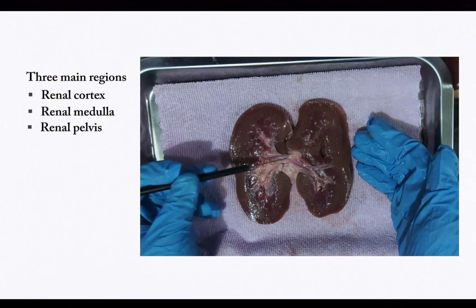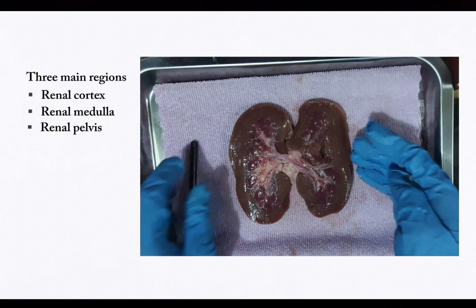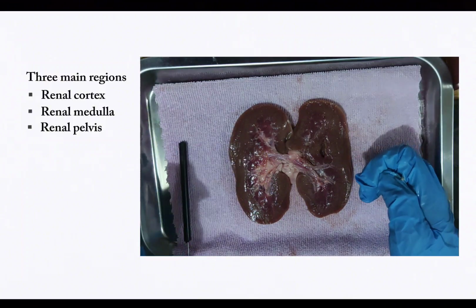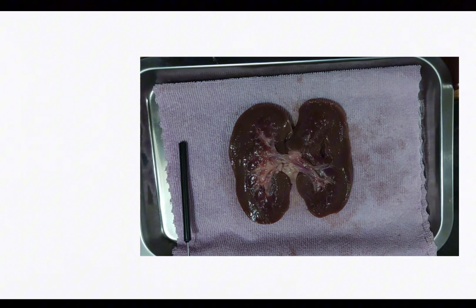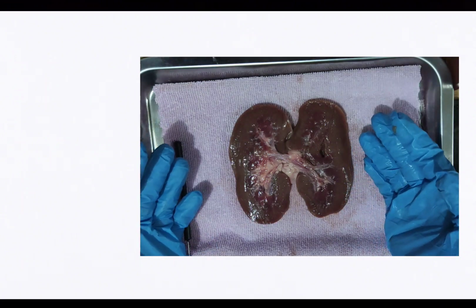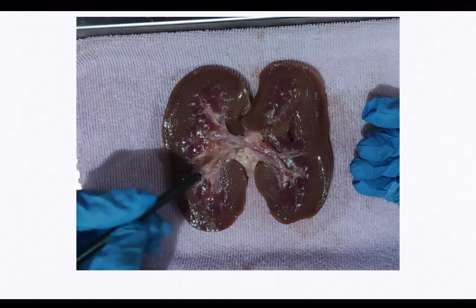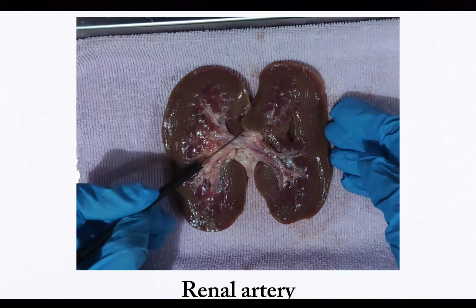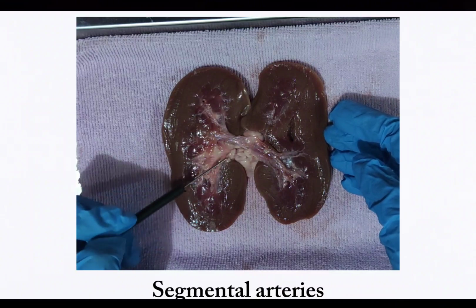Now that we know the three main regions and parts of the kidney, let us dive deeper into the blood flow through different renal vessels and the three major processes of urine formation. Blood filtration and flow begins when the renal artery found in the hilum region separates into segmental arteries.